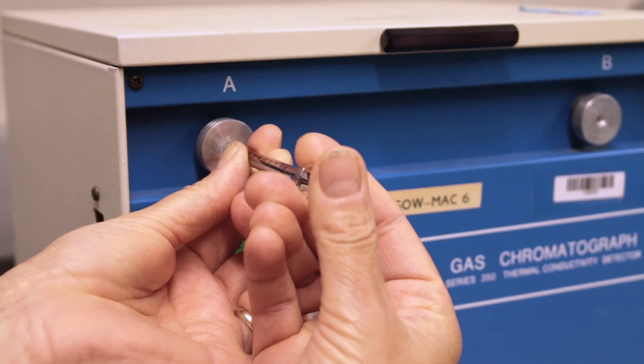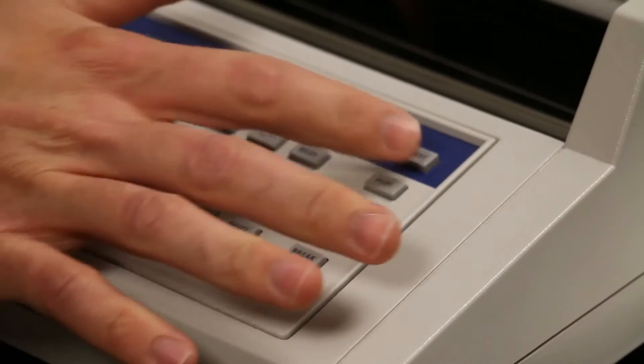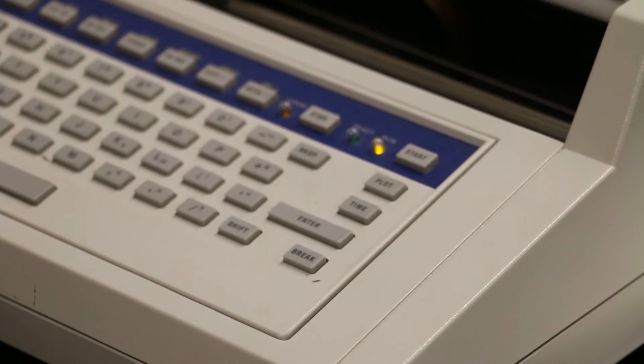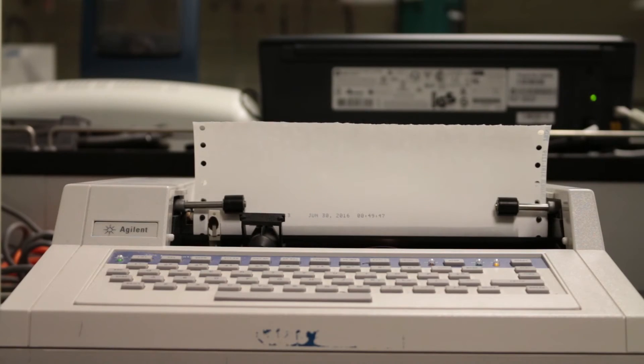When your sample has been injected, smoothly remove the syringe from the injection port. Then press start at the upper right of the integrator attached to the GC. After you see the integrator starting, you can use the time it will take to process your sample to clean the syringe for the next user.